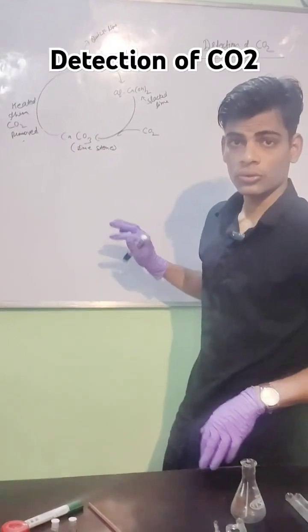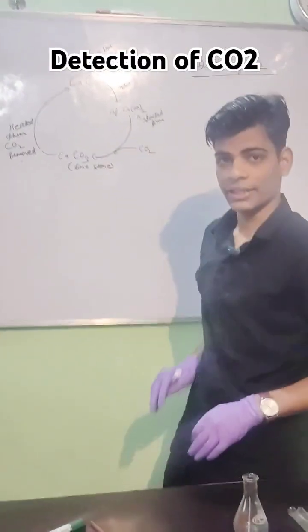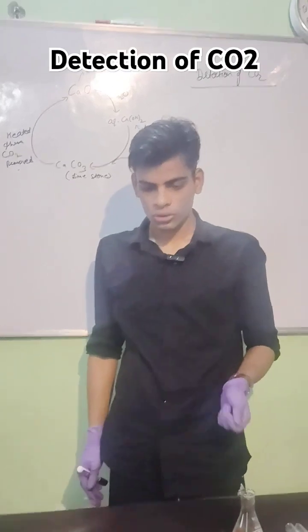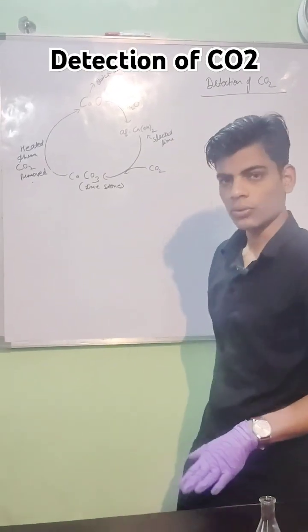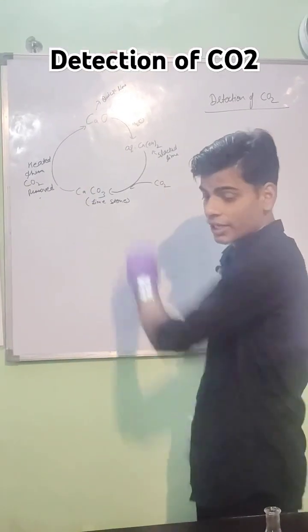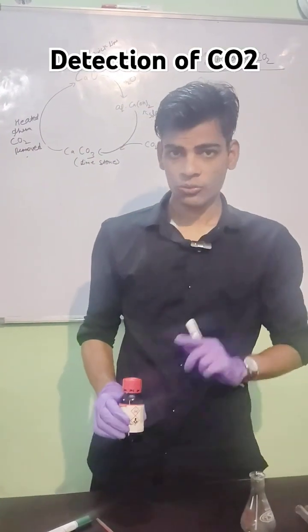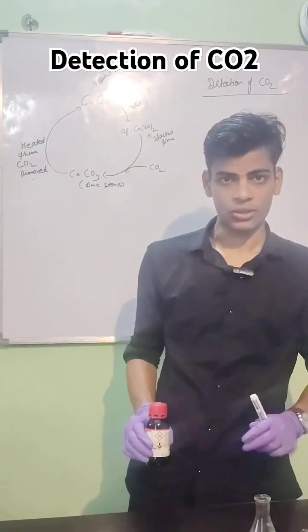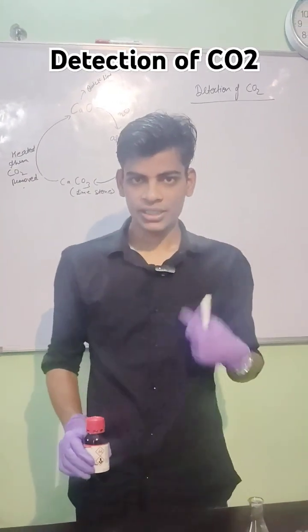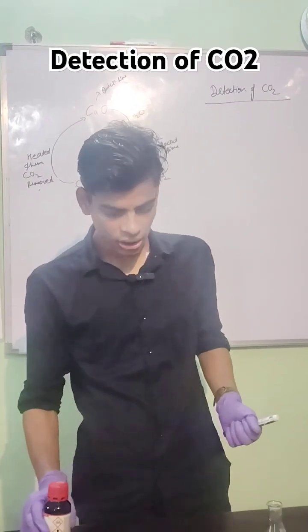Hello guys, today I am going to show you detection of CO2, how we can detect the presence of CO2. So basically what we are going to do, we have quicklime in this bottle, and I am going to show you how we can detect when we exhale CO2 gas.